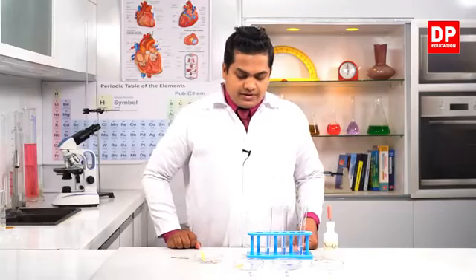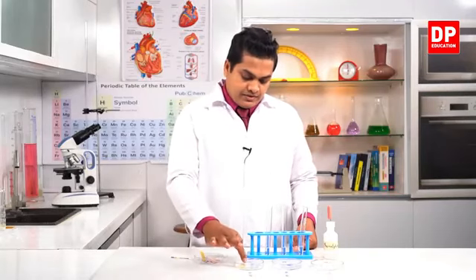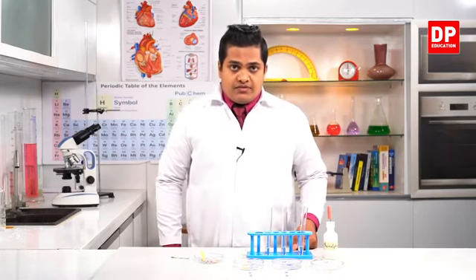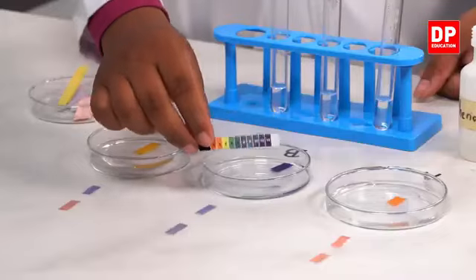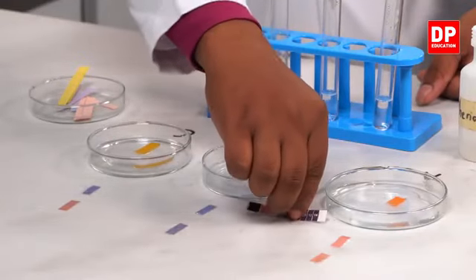So we'll give it some amount of time. Now let's take out these papers and we'll see our observations. To get our observations more accurately, I'll place this indicator in front of you.